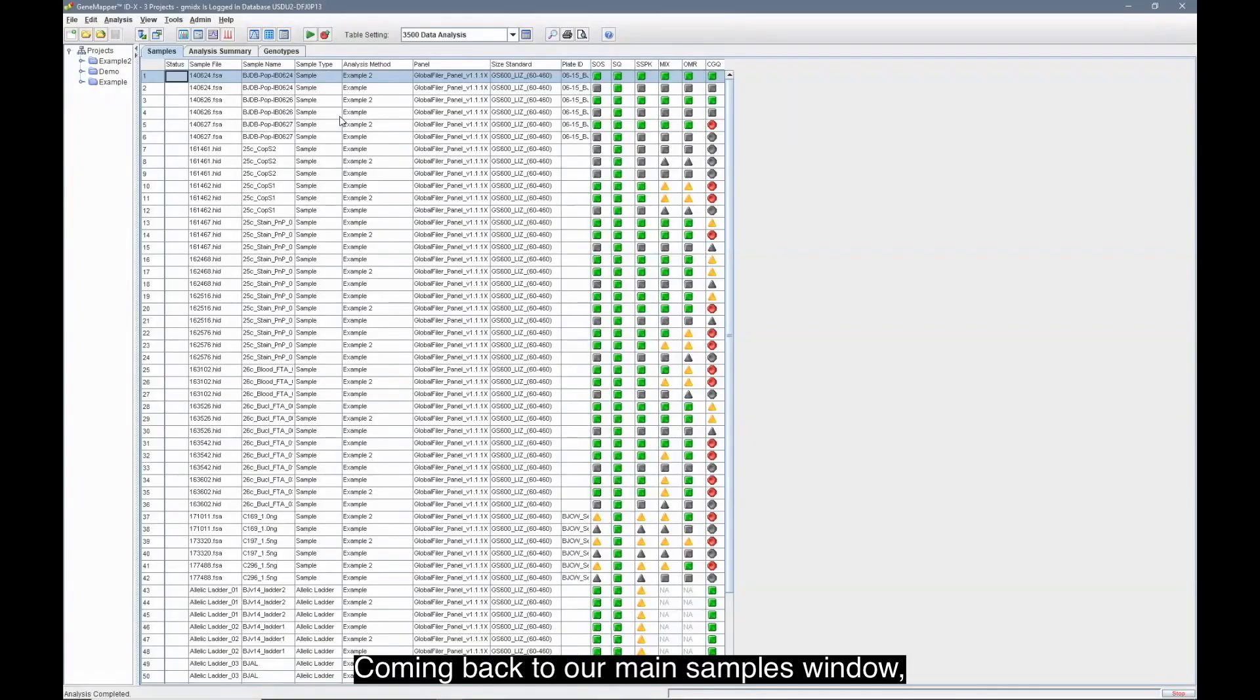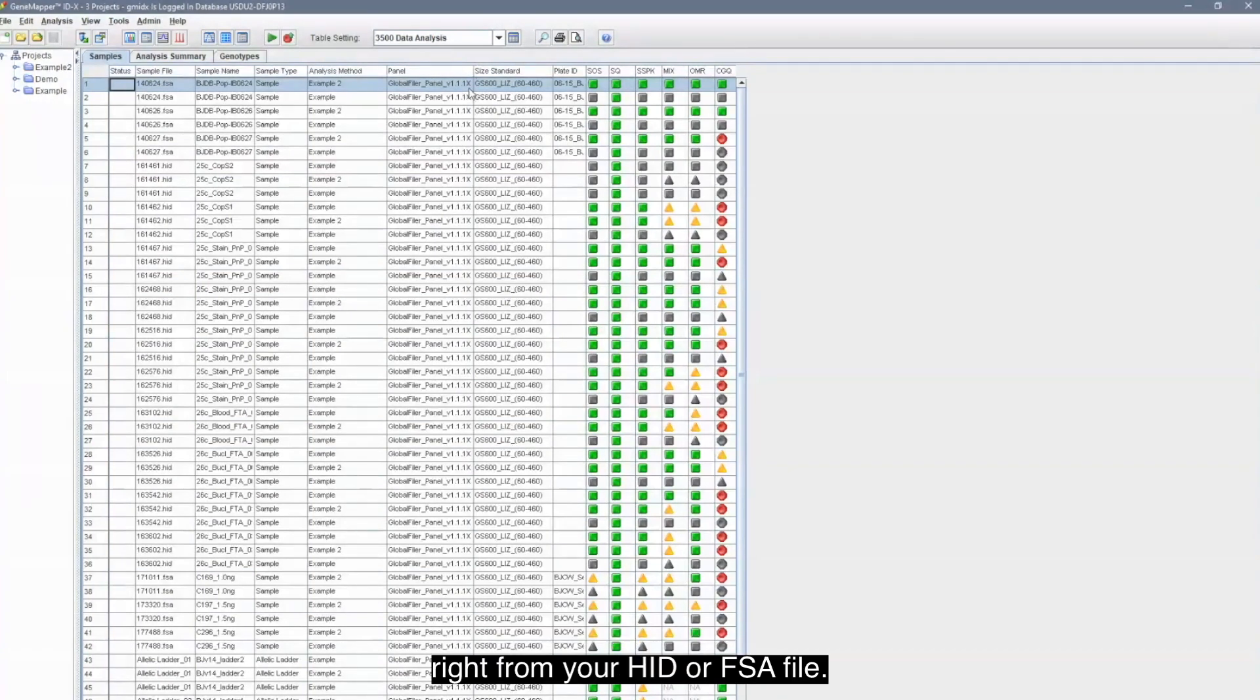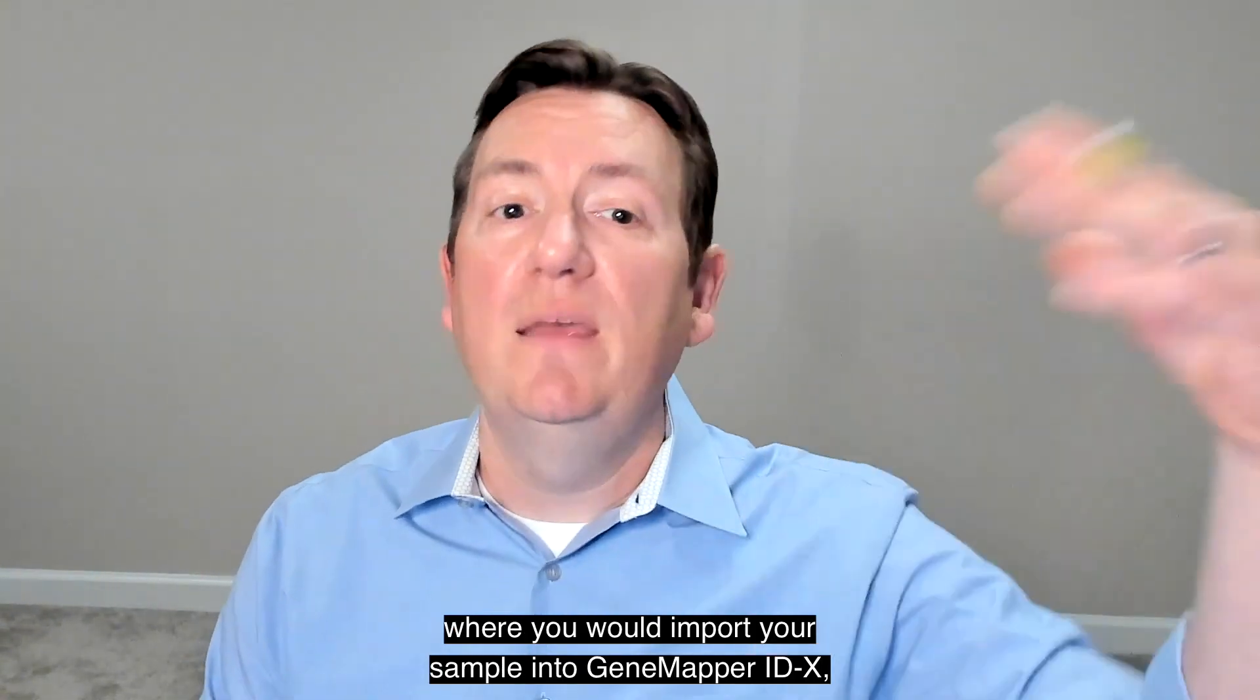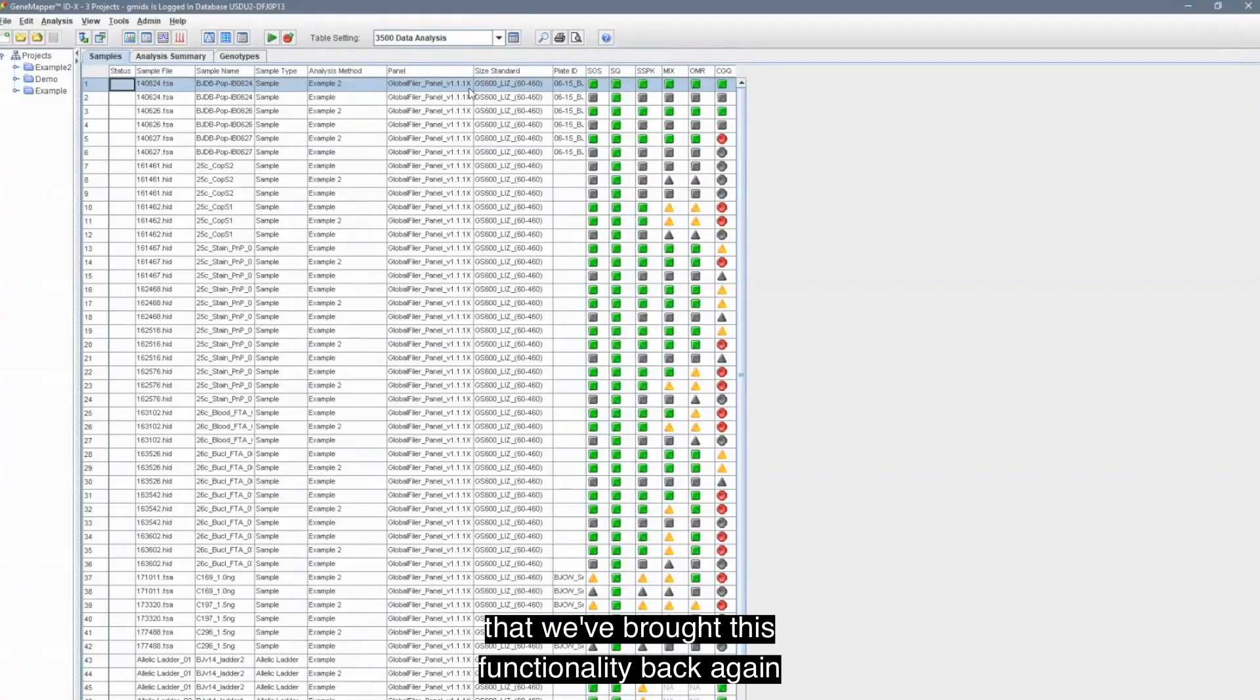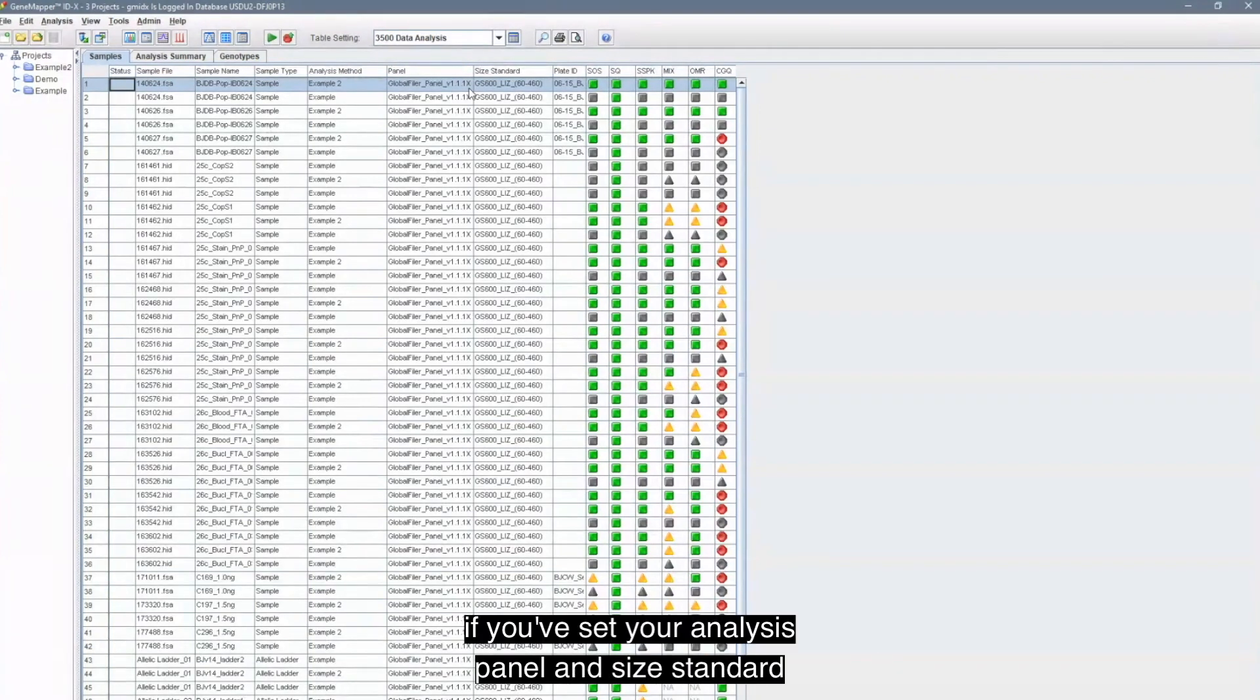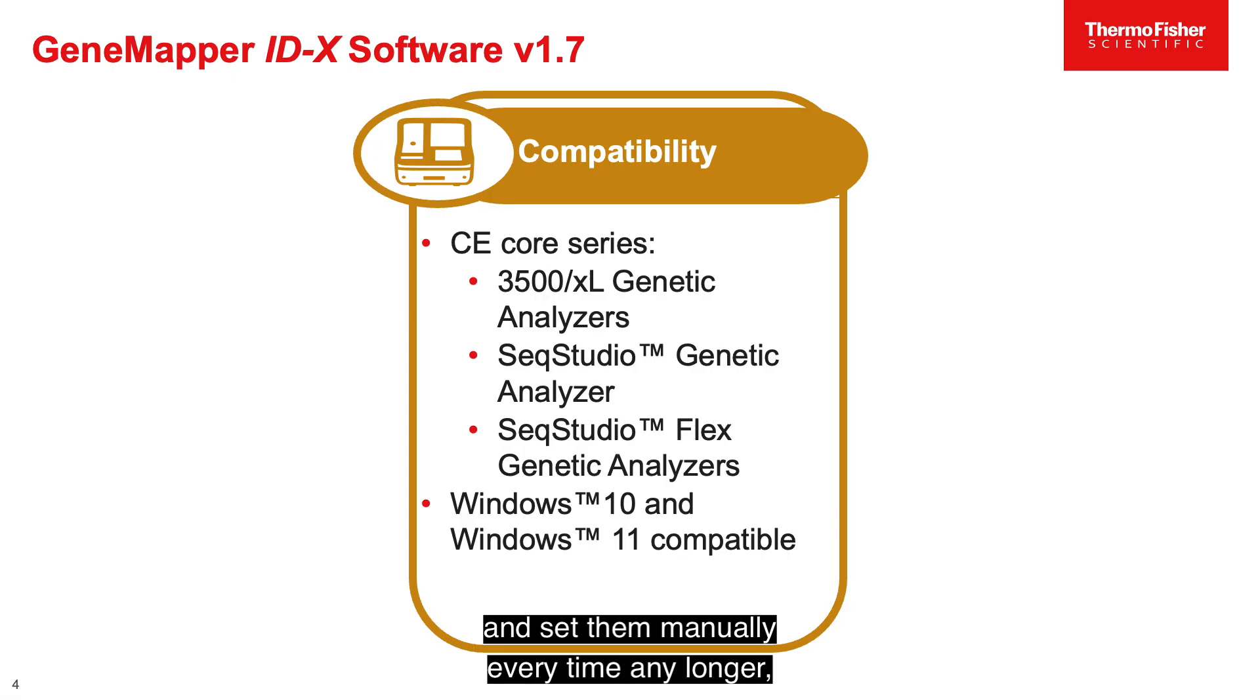Coming back to our main samples window, another new feature we've added to GeneMapper IDX 1.7 is the ability for you to import your analysis method, panel, and size standard right from your HID or FSA file. For those of you that have been around for a while, back to the days of the 3130, you may recall this is a possibility back then where you would import your sample into GeneMapper IDX and with it all of your sample information would be pre-populated as was recorded in your plate document. We're now pleased to say that we've brought this functionality back again with GeneMapper IDX 1.7. So whenever you import your samples into GeneMapper IDX, if you've set your analysis panel and size standard in the appropriate fields, you will now have all of these options pre-populated and you don't need to go through and set them manually every time any longer.